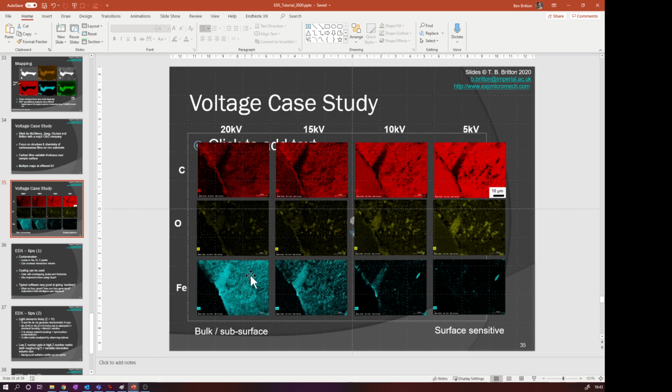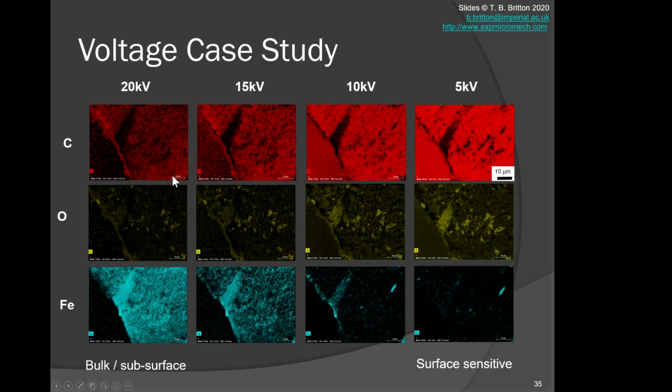As you go down in voltage, you become much more surface sensitive, so the carbon ratio seems to go upwards, with the exception of breaking down in the film, where there are effectively holes and we see that iron rich layer. The sweet spot will also change where we see the apparent oxidation of those carbonaceous rich domains, and that's important when we understand the morphology of these carbonaceous films across our materials.